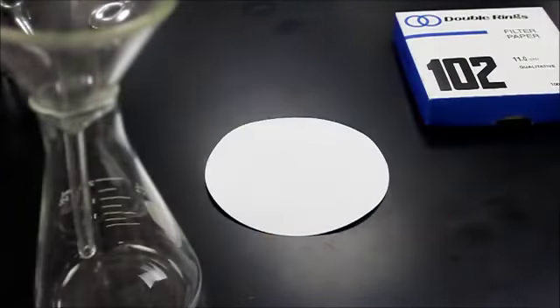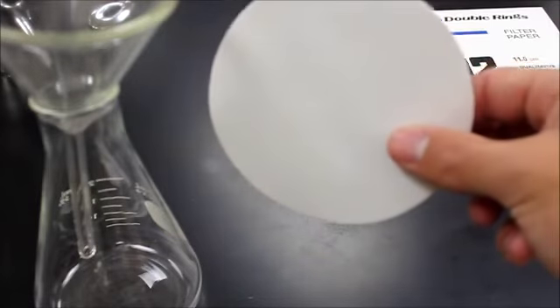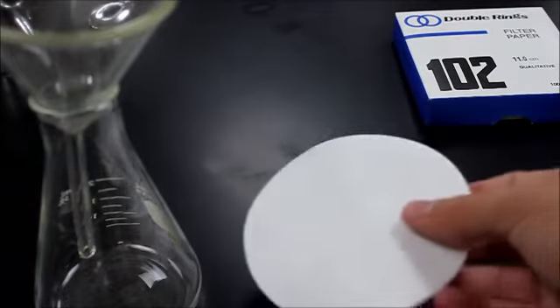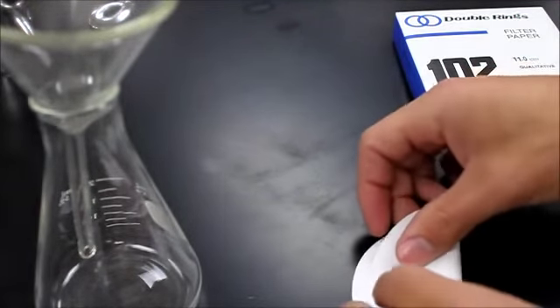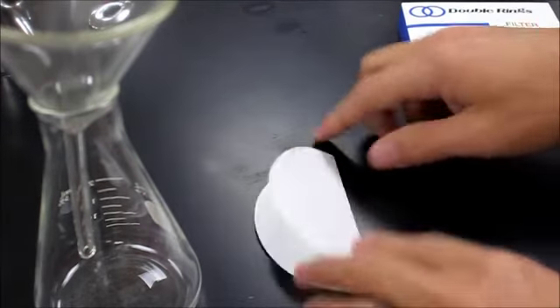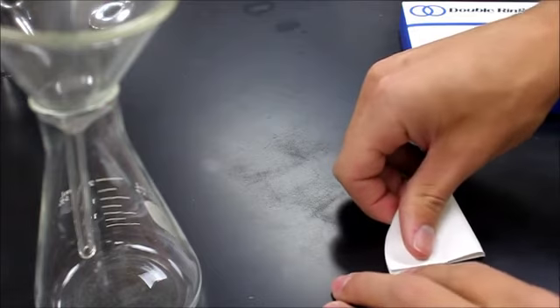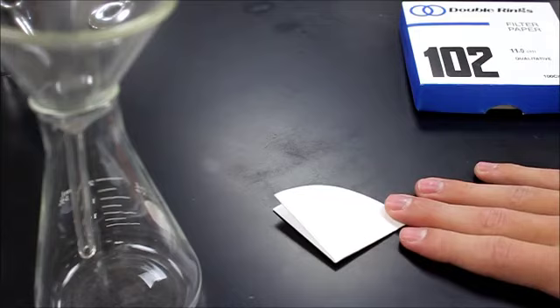One of the next things you're going to be asked to do is to fold some filter paper. In order to fold the filter paper, we need to get the filter paper to fit into our funnel there. However, you can see the geometries kind of don't match. So the way that you're going to fold the filter paper, first you're going to fold this in half. Then you're going to fold it again in half, so that way you have something that looks kind of like a quarter of a pie.